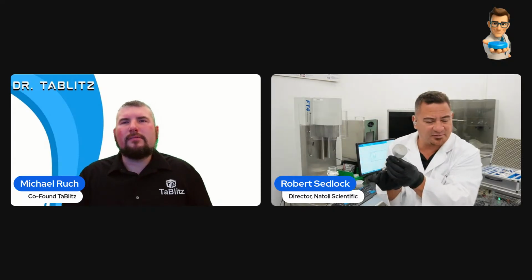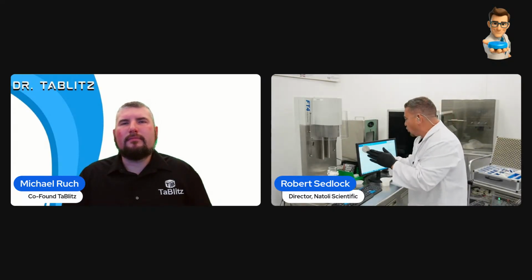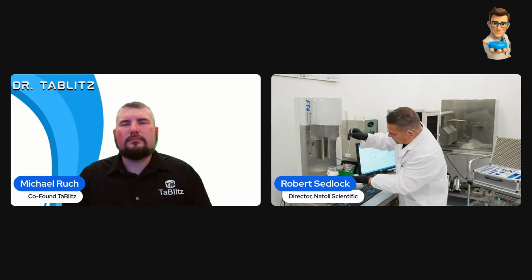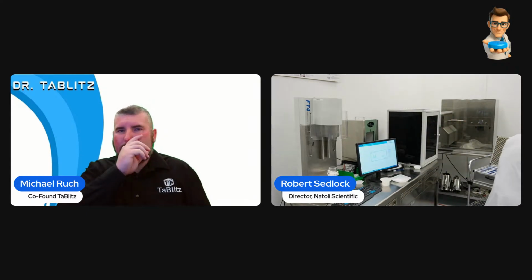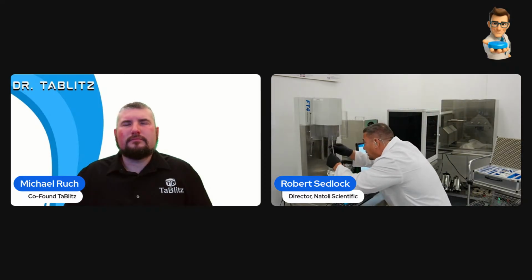Basically what this does is it applies a normal stress to the powder bed to 15 kilopascals. Not tablet compression, megapascal. We're dealing in kilopascals just to consolidate that material. So that's what this vented piston does. Now the last step here, Michael, is I'm going to put on the shear-cell piston here, because now we're going to start actually measuring the shear-cell data here.